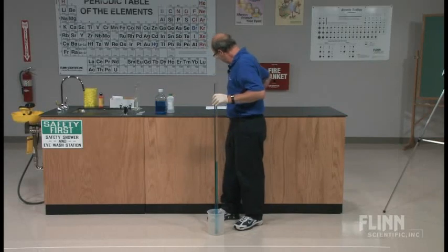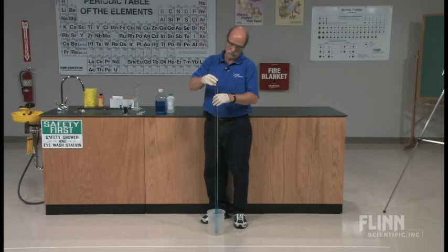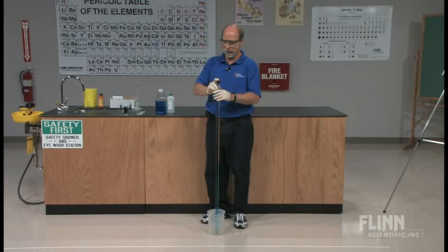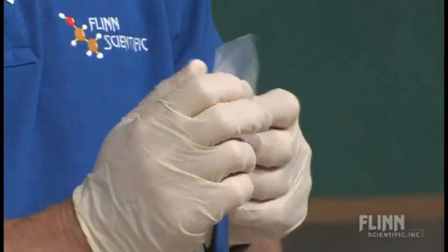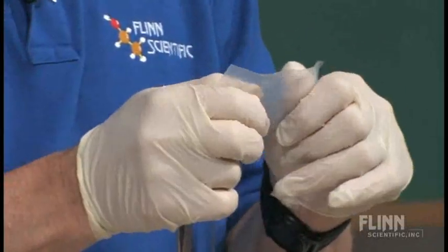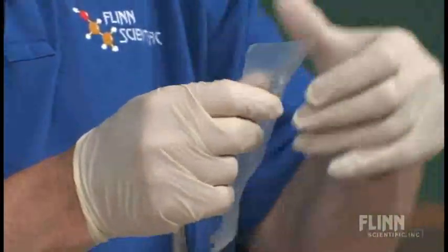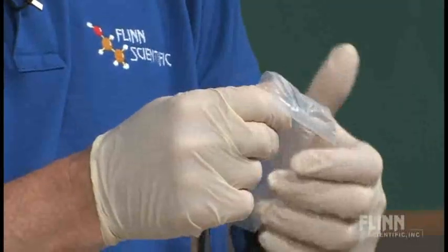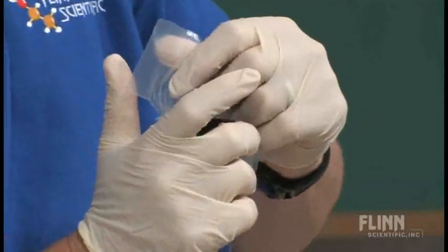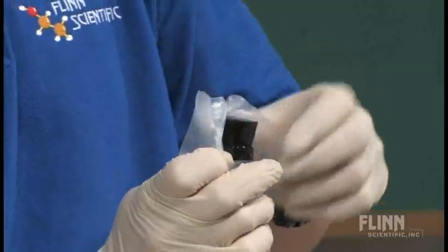Now this next step of putting the stopper on, if you push too hard, you're going to create a pressure down below that might send that stopper off. So this is a rather crucial step in ensuring that you don't have to start over and, B, empty the bucket later on.